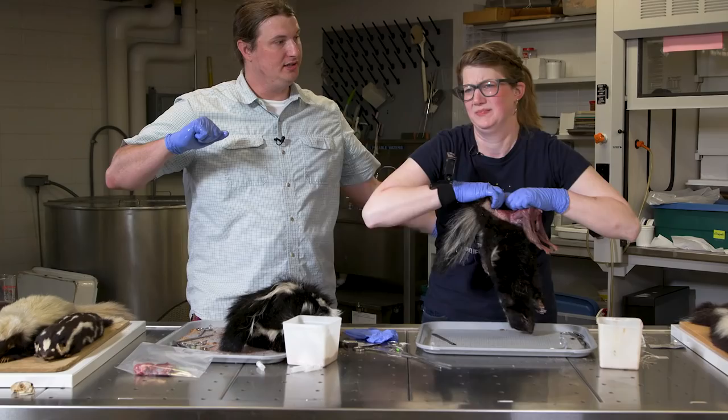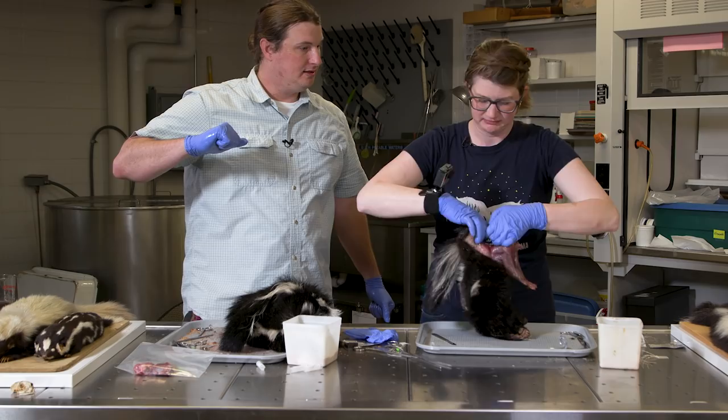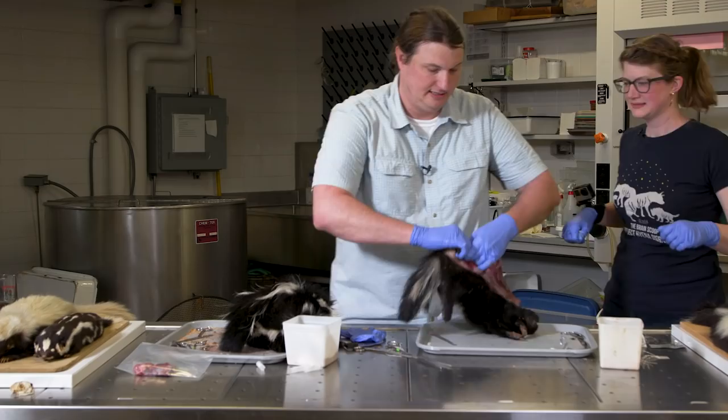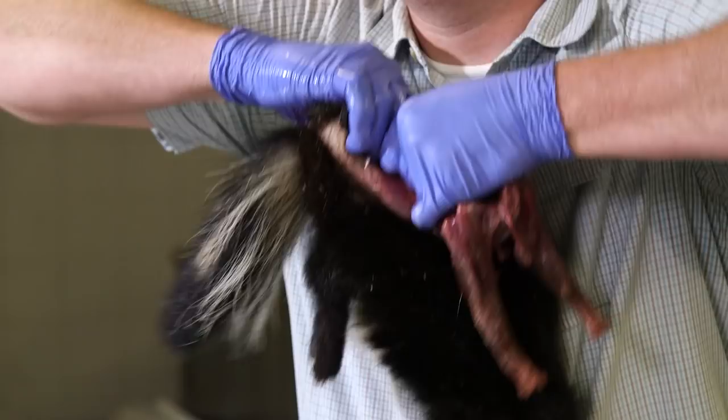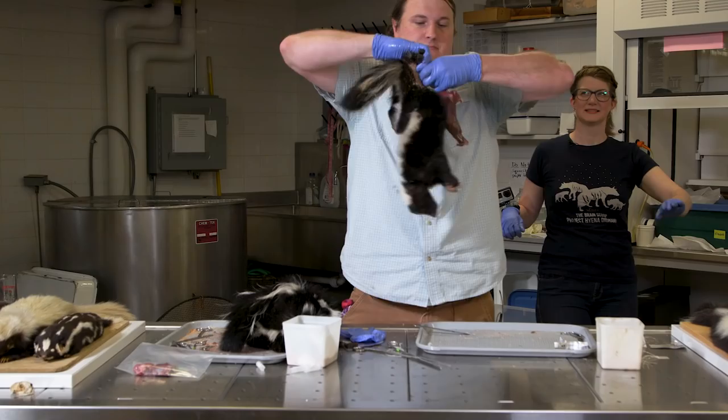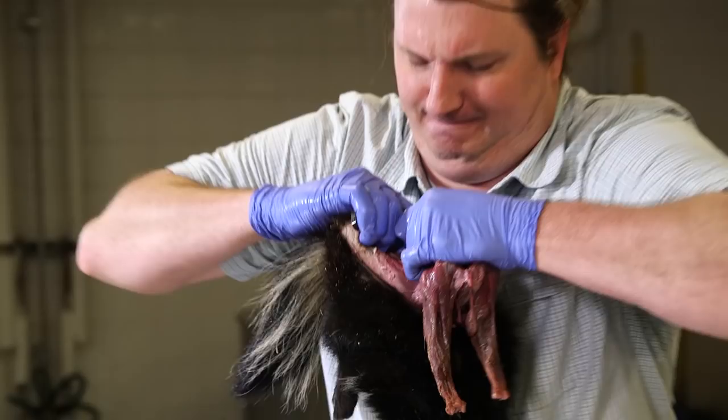It looked like it was about to give — oh man. You gotta watch the elbows! It wasn't just me. We pull the tail out so it doesn't dry shut.